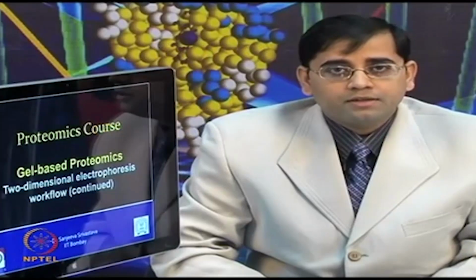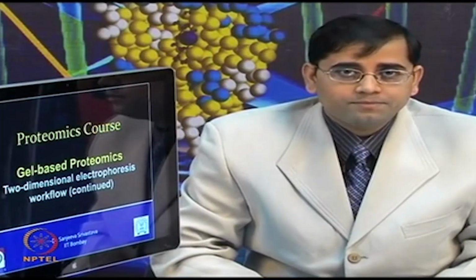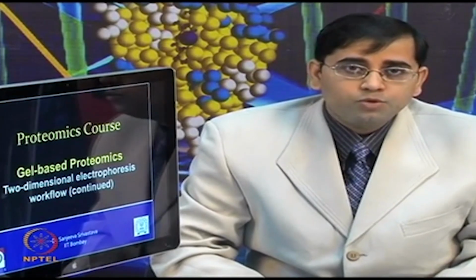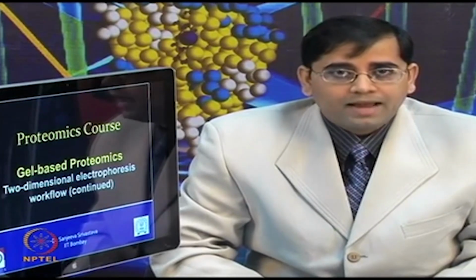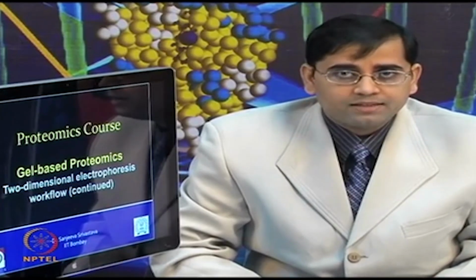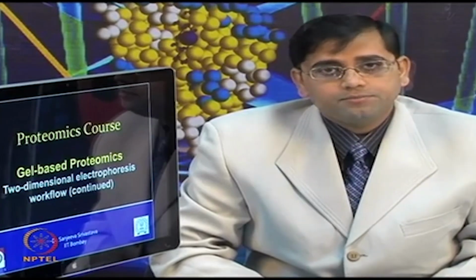As I mentioned, gel based proteomics includes various techniques such as SDS page, blue native page, two-dimensional electrophoresis, and advanced forms of electrophoresis such as difference in gel electrophoresis or DIGE.